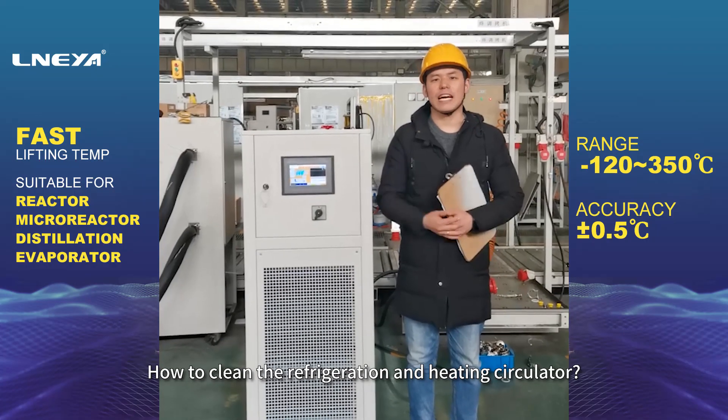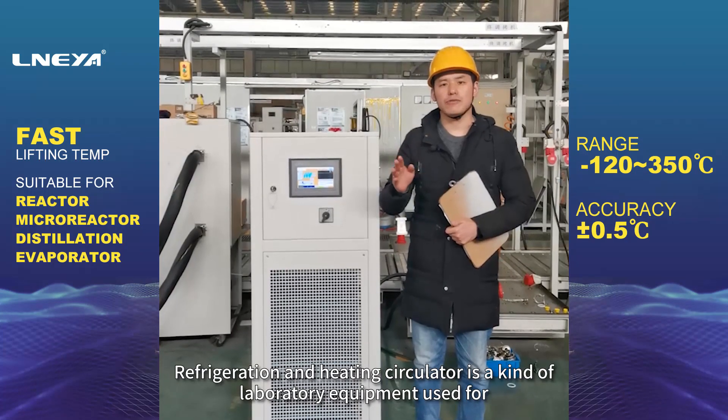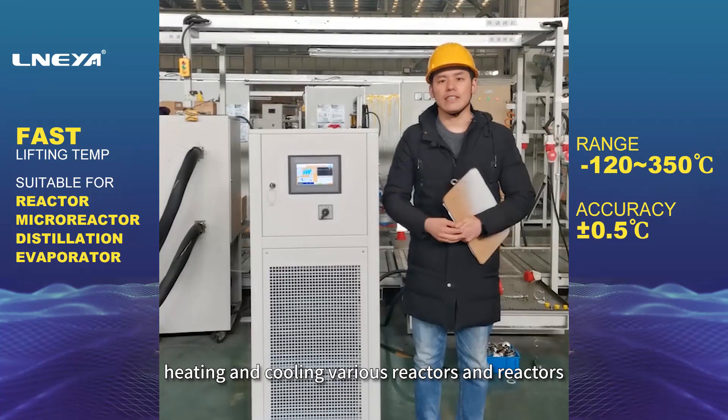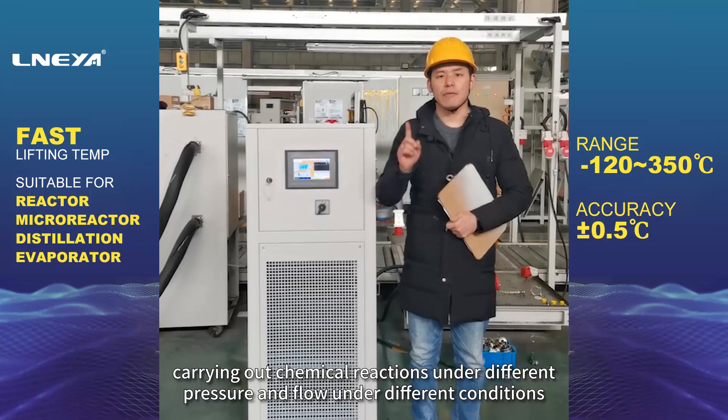How to clean the refrigeration and heating circulator. A refrigeration and heating circulator is a kind of laboratory equipment used for heating and cooling various reactors, and carrying out chemical reactions under different pressure and flow conditions.